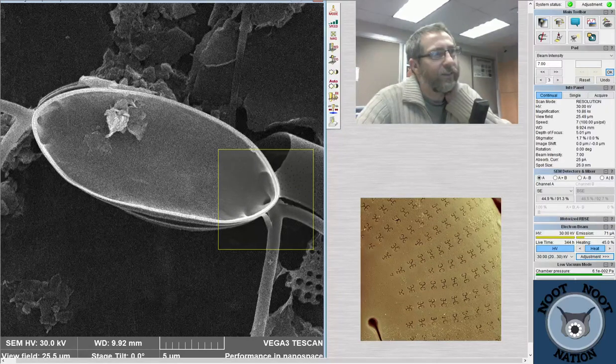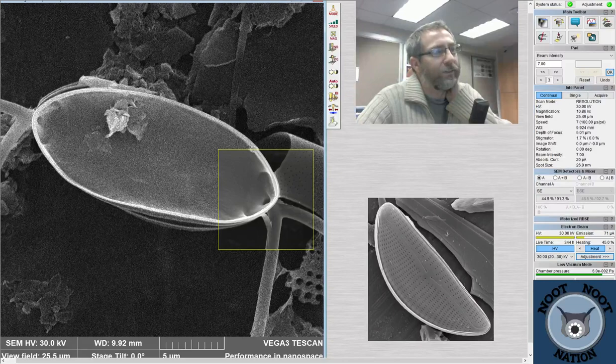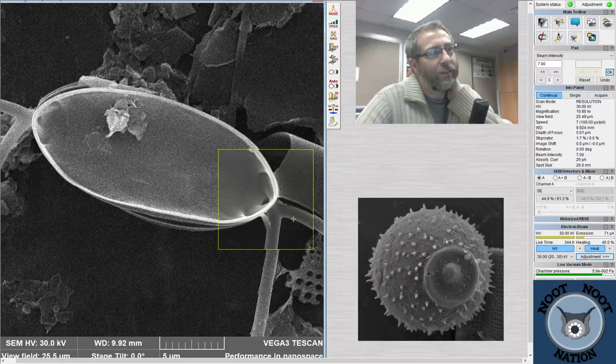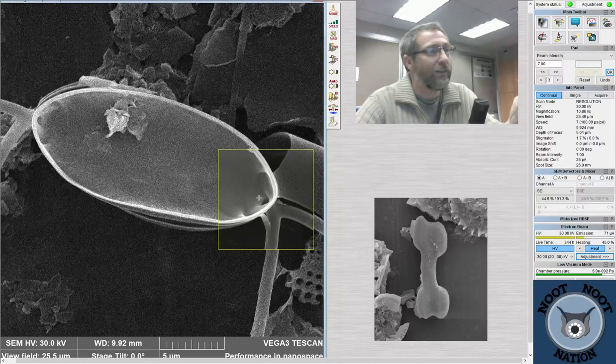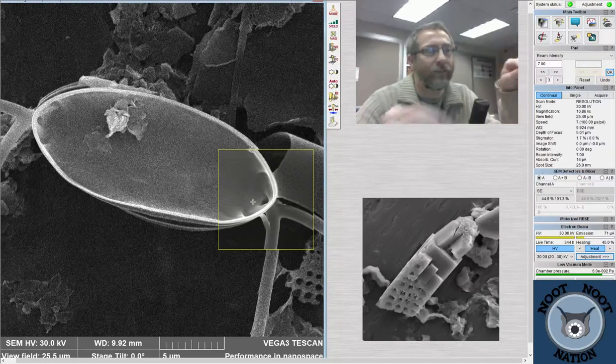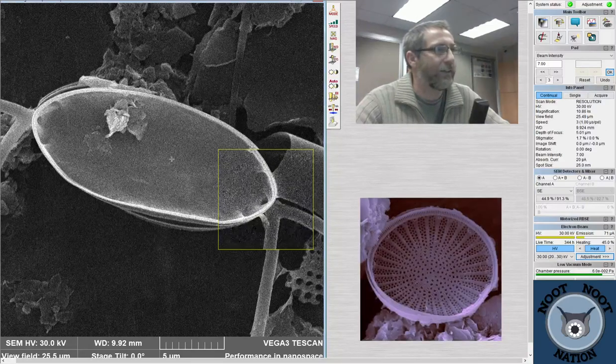Chaetoceros have these like long spine-like structures that stick out from the valve face. And I've mentioned this before, but they're not really spines. They're called setae. And the reason that they're not spines is because they're hollow, and the diatoms sometimes will put their chloroplasts out in these long tube-like structures. And you can see right here, there's a hole, an opening that goes into it. And so if it were just a spine, in diatom language, a spine is just something that's ornamental, and it's usually solid. And the spine would just be sitting on the valve face, and there would be no connection between the inside of the diatom's valve and the spine itself. It would just be like a structure stuck on the outside, truly ornamental in nature. And that's how we would separate these out as something different, as not spines, because they have that structure.